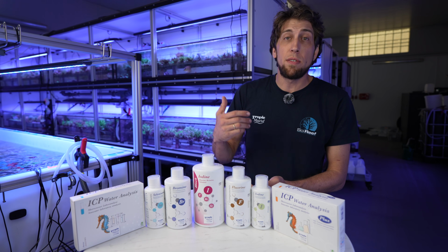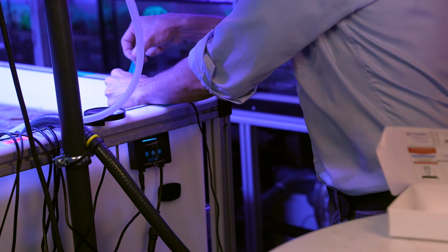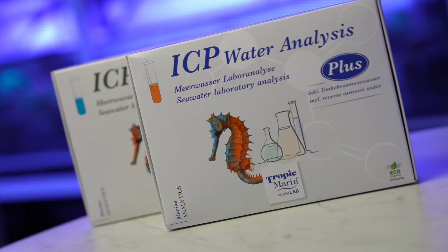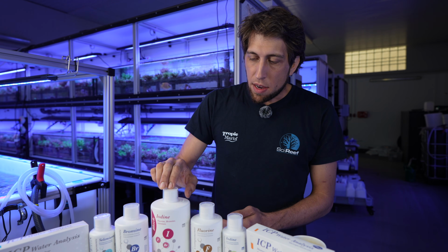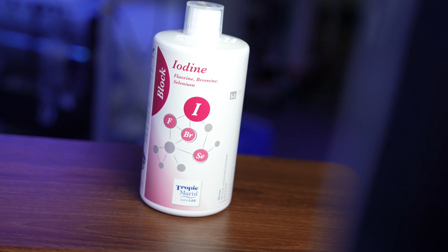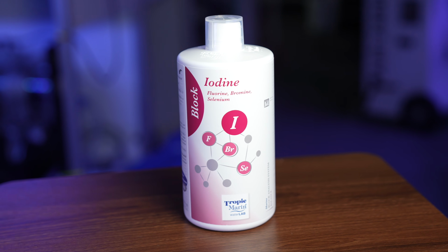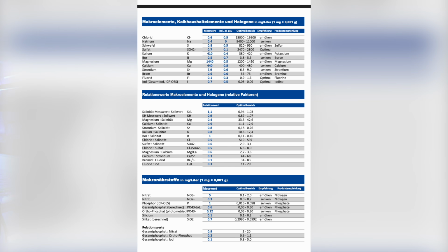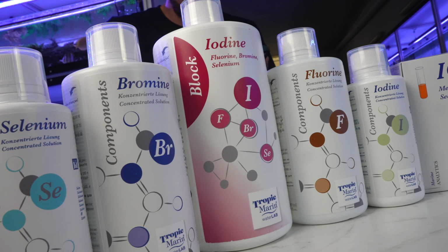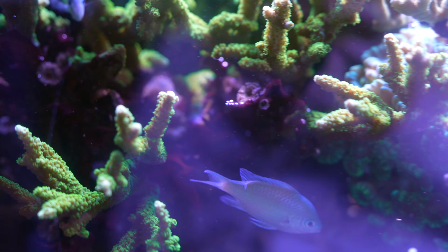so it's always good to keep a good eye on the chemistry, and the ICP allows you to have a good overview of your water chemistry and the needs of your system. So we recommend to test your water with an ICP analysis. You can potentially detect deficiencies in certain element groups or certain individual elements. The other aspect of the combined solutions is that we have one indicator element. In this case it's iodine, that can be measured relatively well, because some of the elements that occur in very low concentrations are hard to measure, or the data are not that accurate. But with the indicator element, if there's a deficiency, we can usually assume that the other ones in this group also could use some input, and that's how the system works.